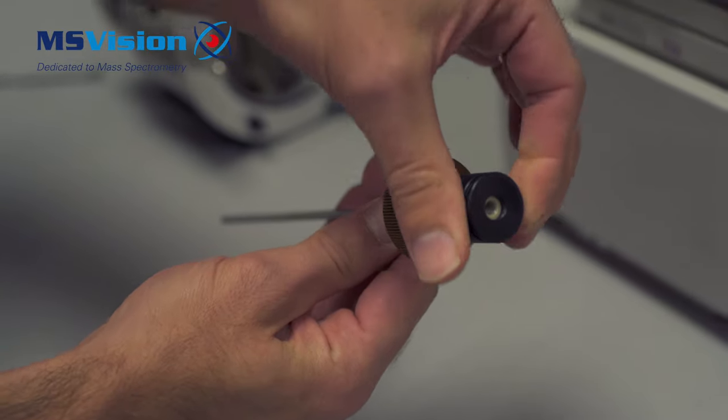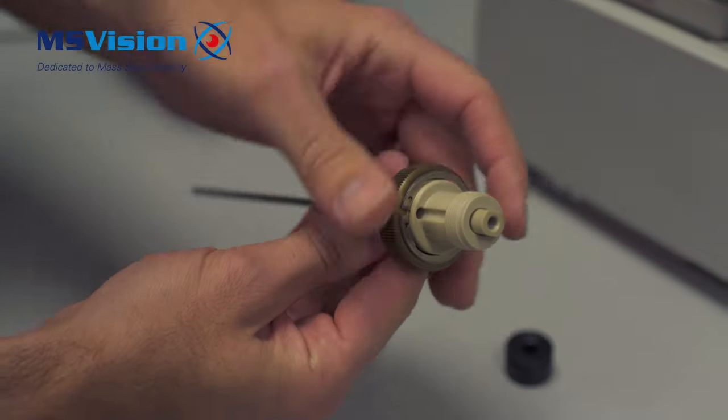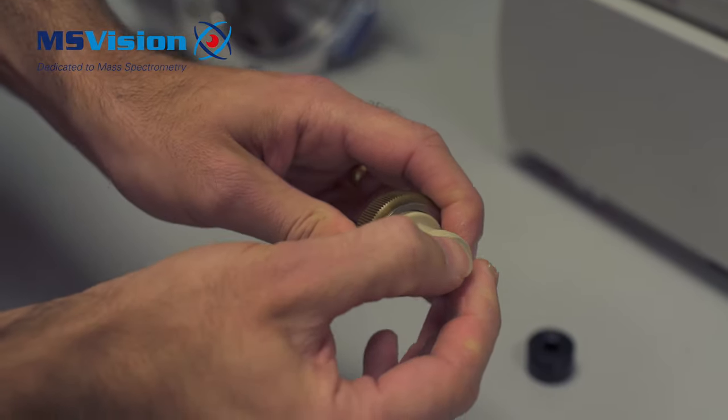Remove the black locking nut and pull out the capillary holder. Please note that there is a spring under the holder, so make sure this is removed as it can fall out.